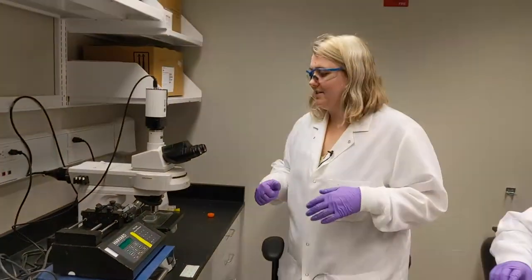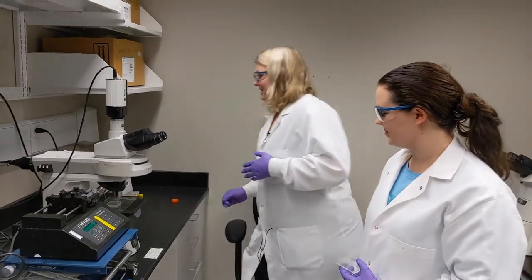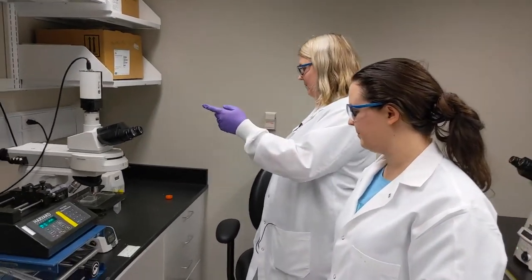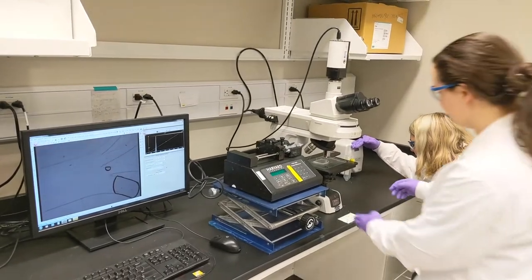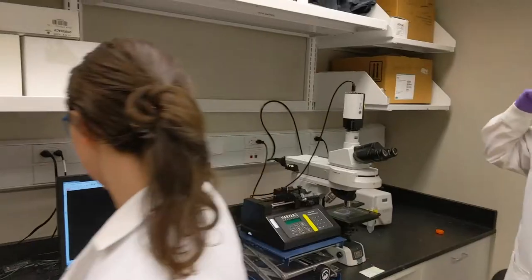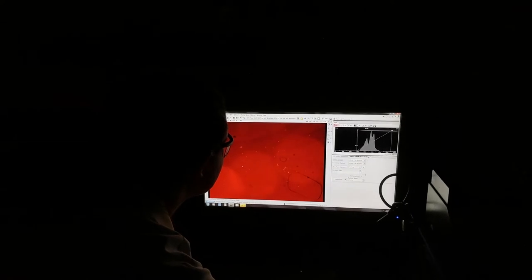Okay, let's do it. Okay, so we're going to turn on the microscope box. This is a fluorescent light source that allows us to do fluorescent microscopy through our camera. It's thinking. Think faster. I think it's on. At least it doesn't say cool. Oh, we can find out. It's on. Okay, we're gonna turn off the lights. It's dark. So we're gonna look at this in PE, which is the fluorescent red. Ooh, nice and red.